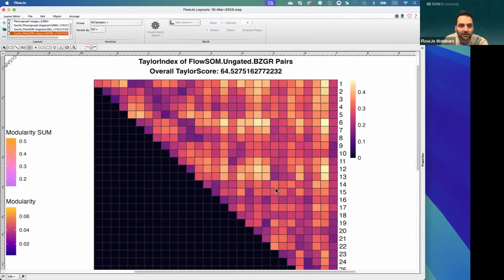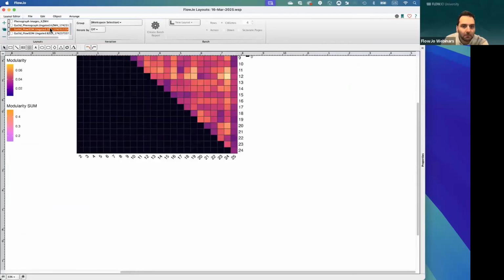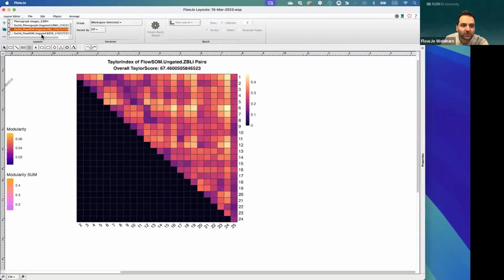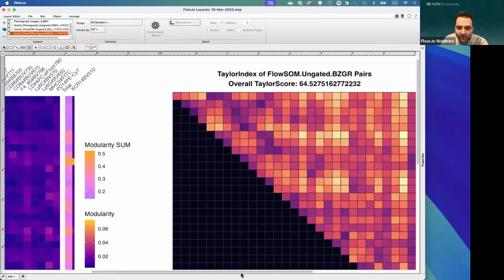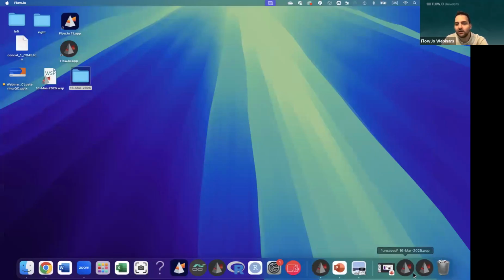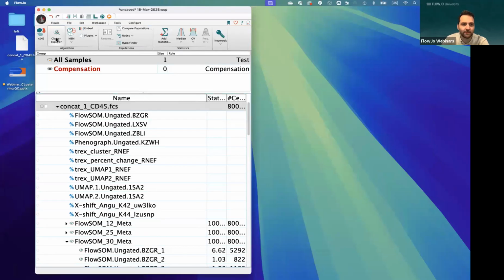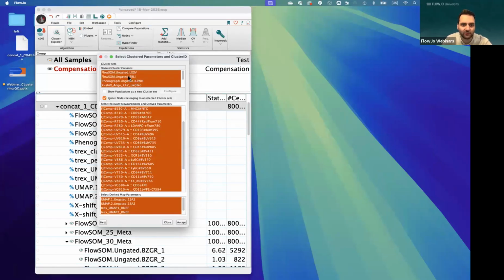Yeah, so I don't see any really low value. But just to indicate, as an example, let's say you had cluster 24 with 27. Yeah, it's not that low a value, but okay, 24 to 27. I could go again to my Cluster Explorer and check those clusters.